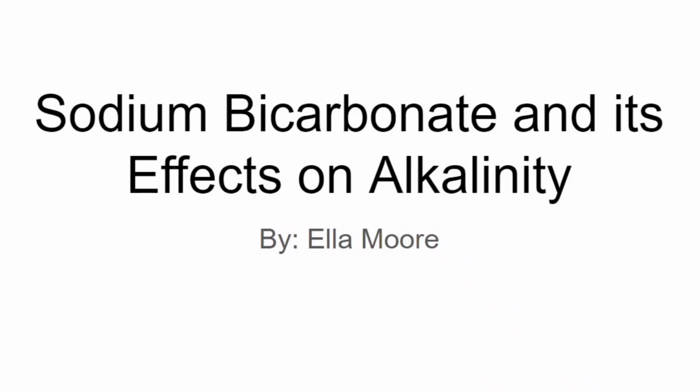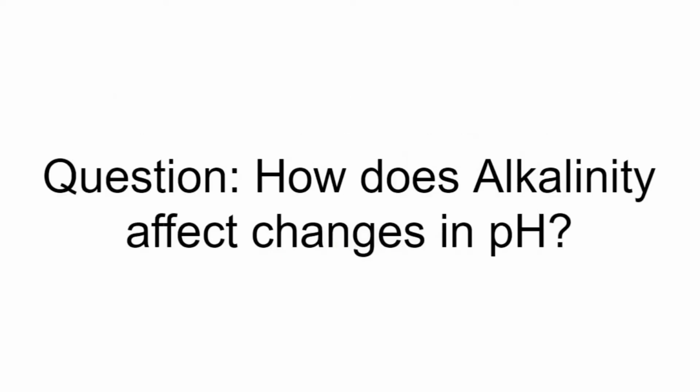Hi everybody, my name is Ella Moore, and today I'm going to be conducting an experiment on the effects that sodium bicarbonate has on alkalinity. This at-home experiment was done for exam 2 of Engineering 351, or Introduction to Water Quality. So the question I'm going to be trying to answer today is, how does alkalinity affect changes in pH?